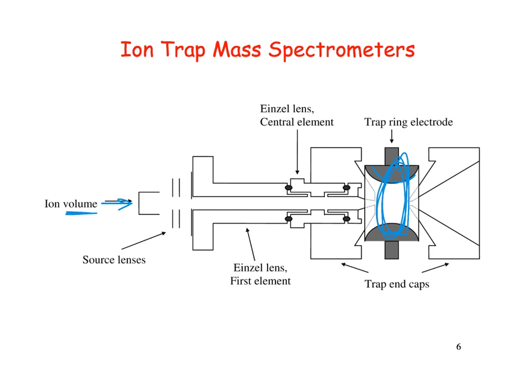It's like a donut. And then this is an electrode here, and there's one on this side as well. So there's the donut in the middle, and there are the 2 electrodes, the caps on each end. And they can run various experiments with this by either having a direct current or alternating currents on the trap ring electrode versus the ends. So essentially the ions come down here in the middle and they get trapped in here and they can be cycled inside the ion trap.